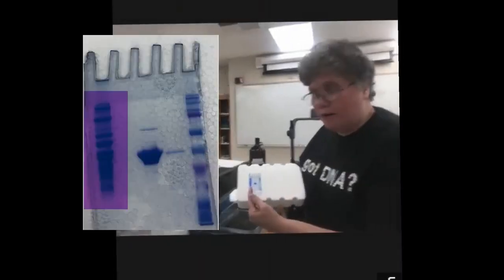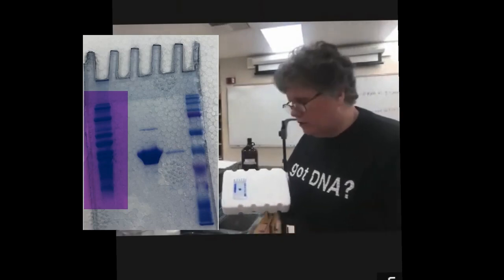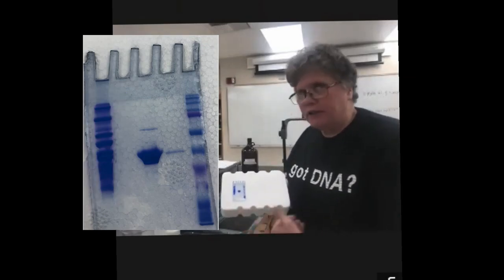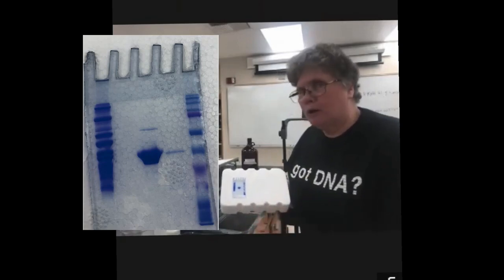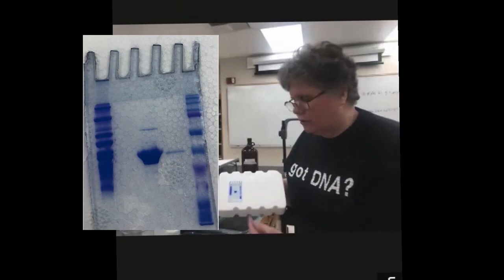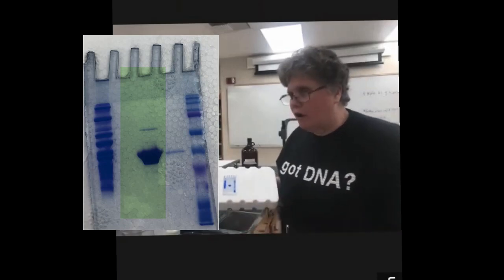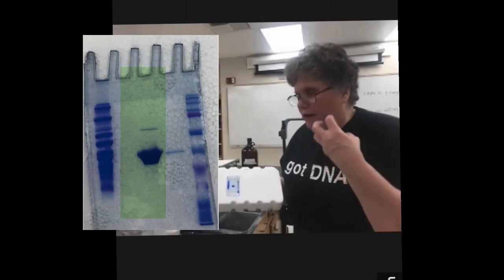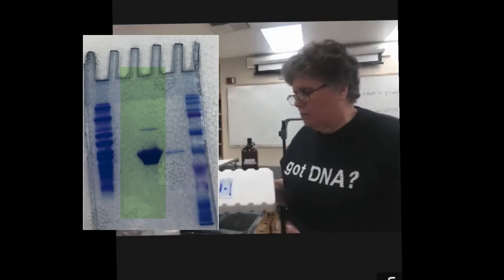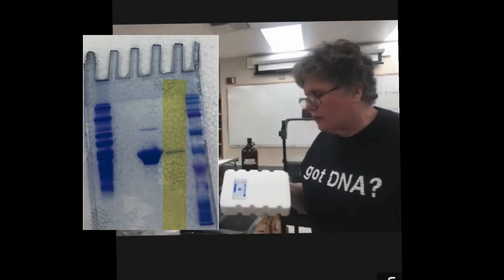This is our S1 lane, and you can see in our S1 lane, we have quite a few proteins. I actually, on this gel, did not load S2, so you can't see S2, but generally in S2, you're going to see that you have fewer proteins than you did in S1, because we've done an ammonium sulfate fractionation so that we only have part of the protein. The middle lane is S3, and you can see we have a very large, big band of S3 because we had a lot of protein. Remember, our absorbance was over 3 when we got it off the column, so we have a very, very large amount of that. And then that little thin band next to it is our S4.